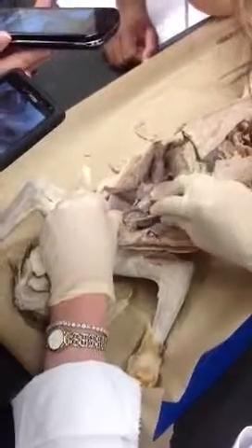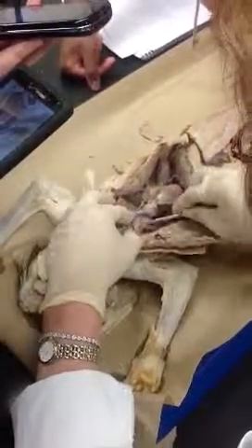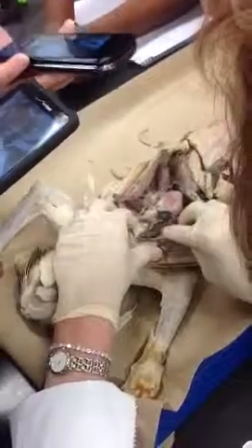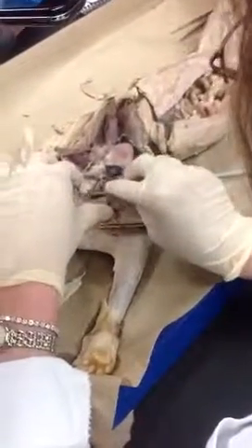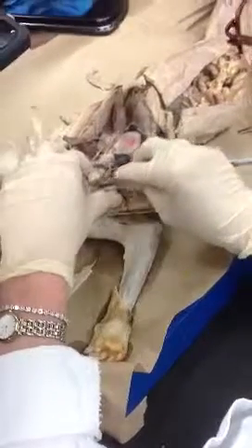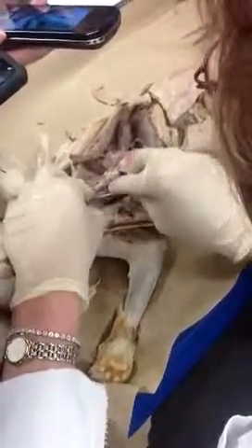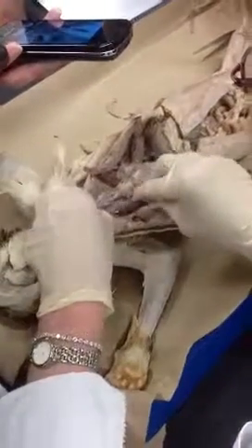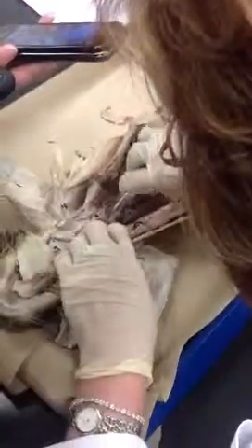Okay, as soon as this branches off here, there is one vessel that goes down. This one is called the internal mammary. Because this one right here, it goes down. And as soon as that branches, you see it goes down. Right across from that, again, we're kind of trying to keep these fluids out of the way, are 3 vessels, 1, 2, 3. Just exactly on the other side. Let me see if I can pull this out here. Do it this way.